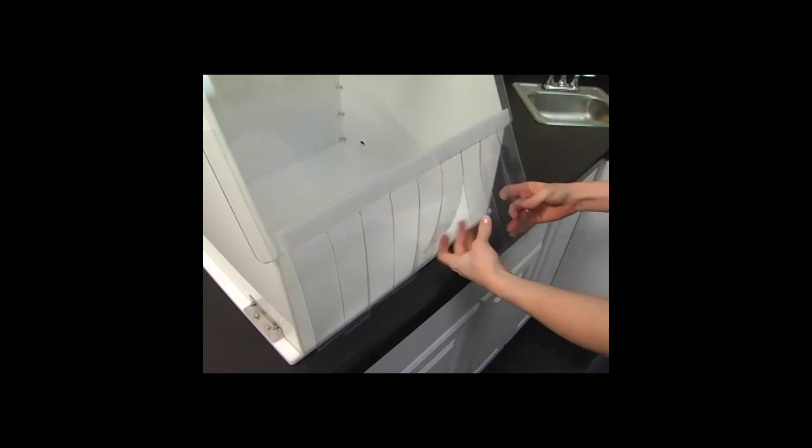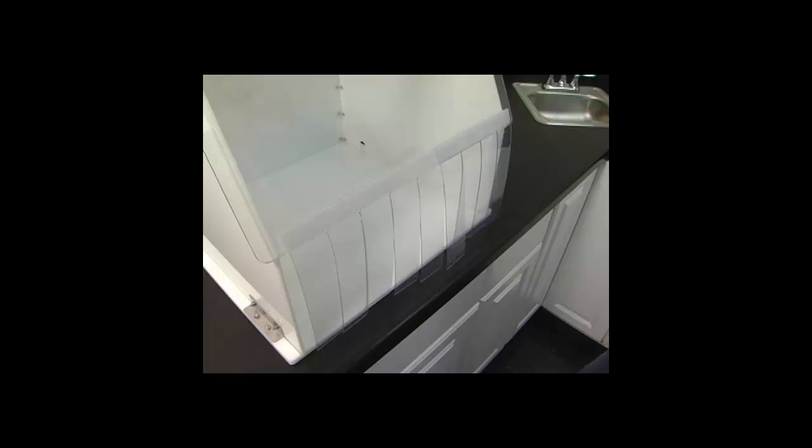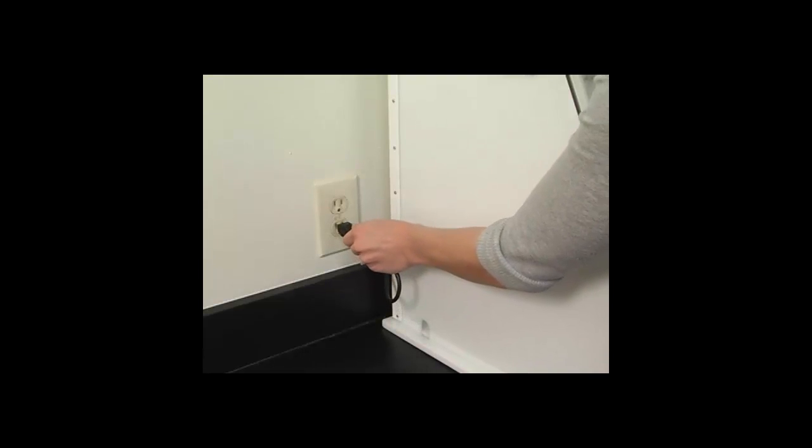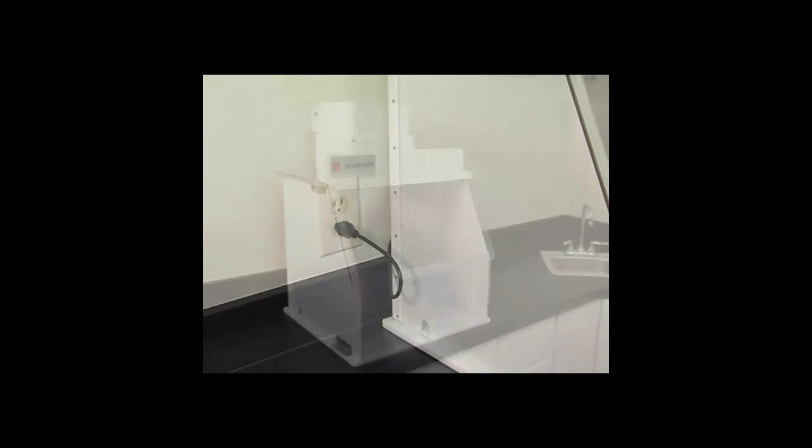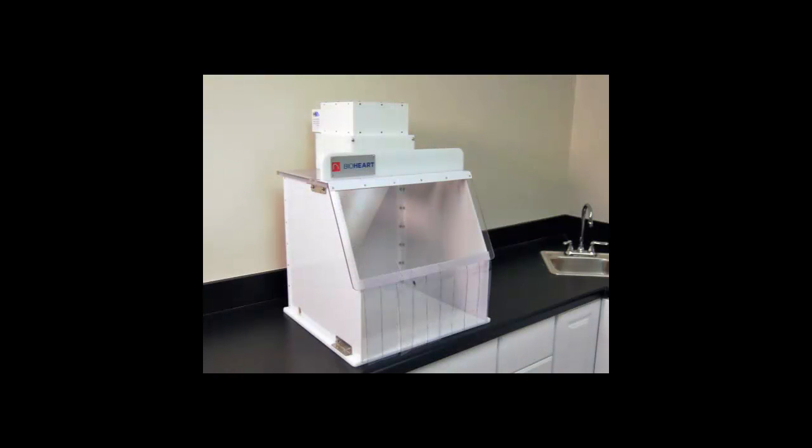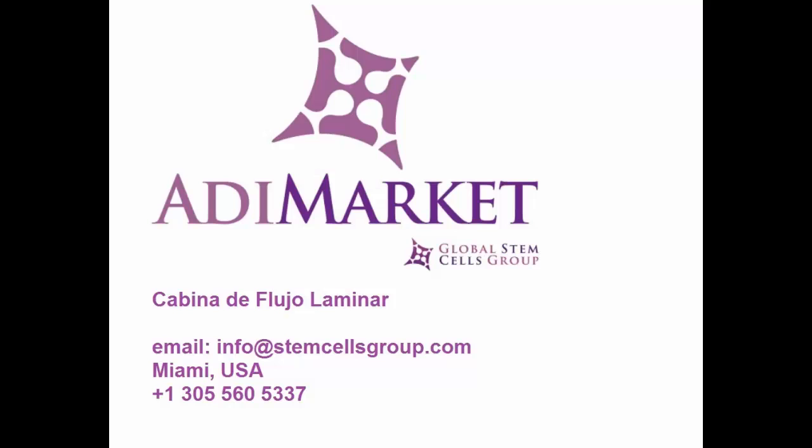Attach the plastic hood snap flats to the hood and separate the bottom of each hood flap so that they are not connected to each other and the flaps can move freely. Once the air cleaner is set in place, plug the unit into a 110 volt grounded outlet. Your flow hood portable clean room is now ready to use.